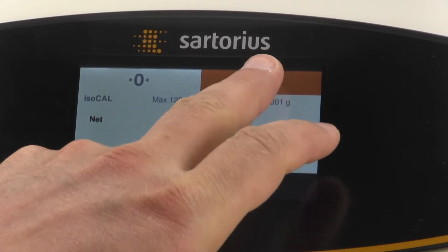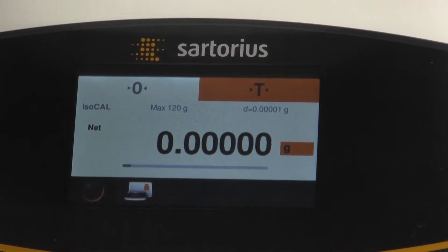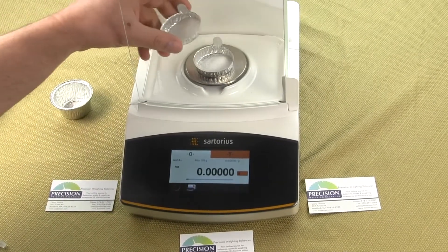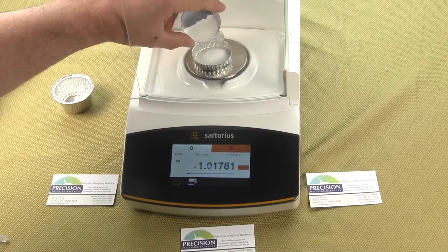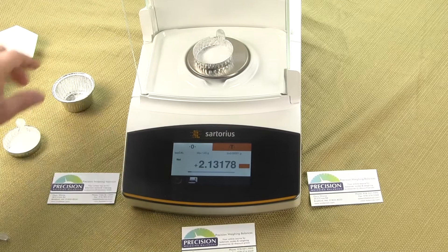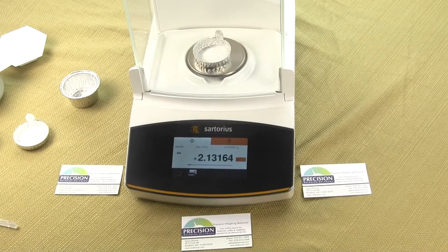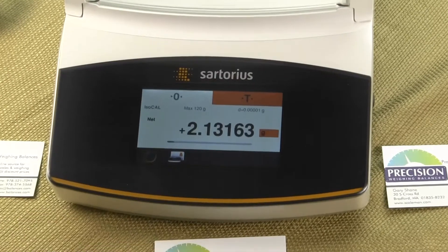We can actually tare out again. So we can tare out this sample, and if we wanted to add more — say if there was a different component — we could just add on the second component, pouring it onto or inside of the weigh container. Always close the doors, and once we get a bold font we have a stable reading.